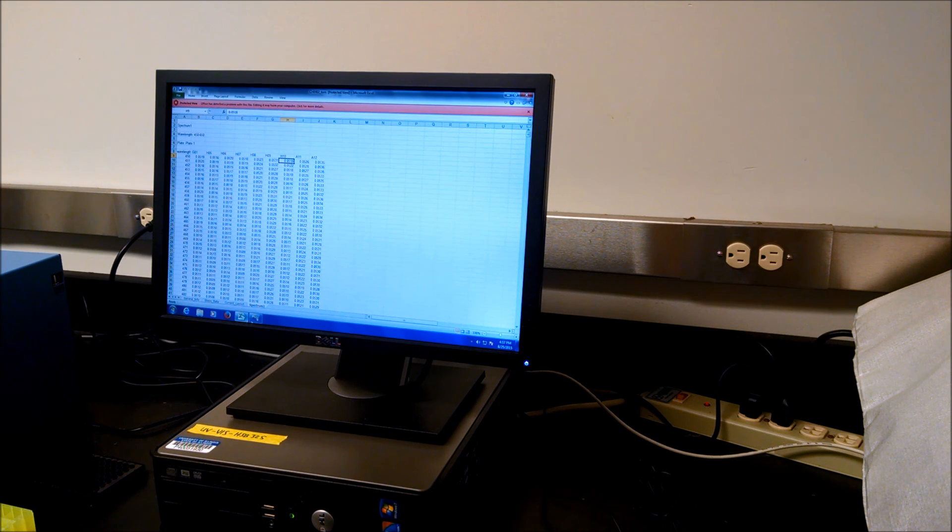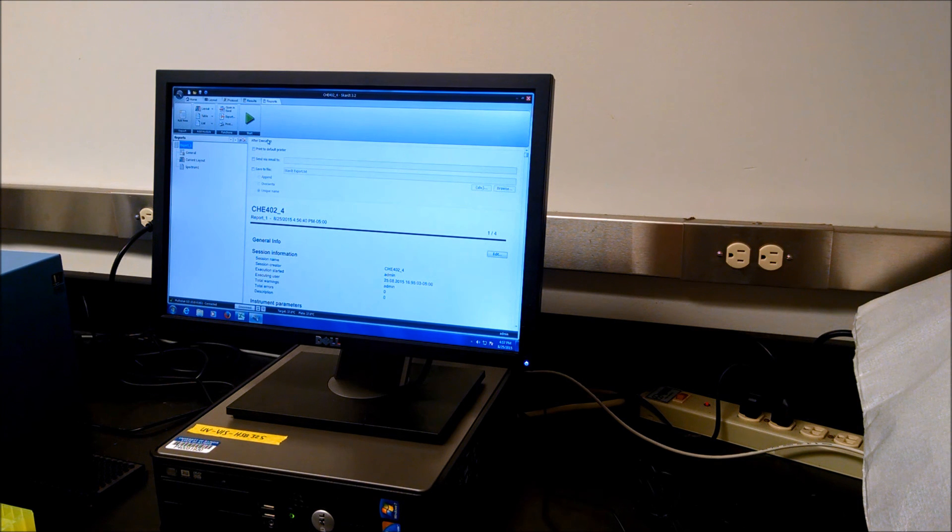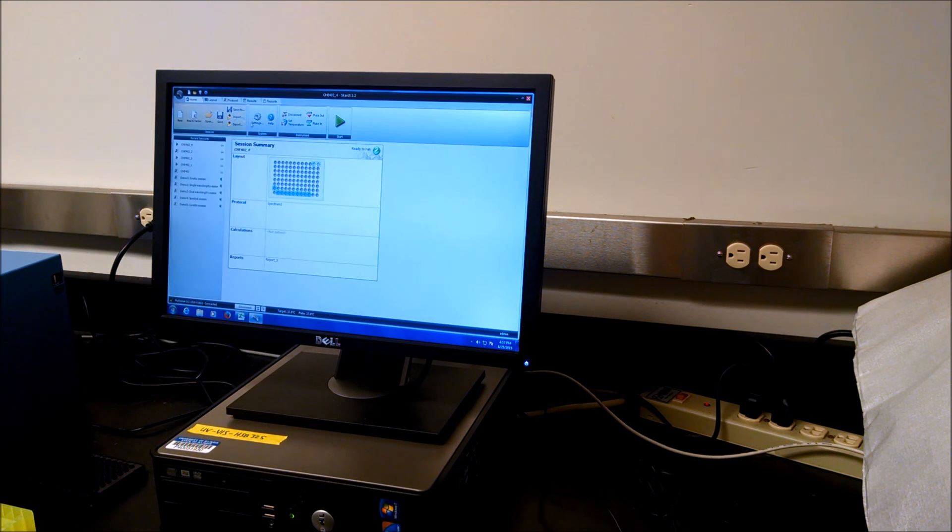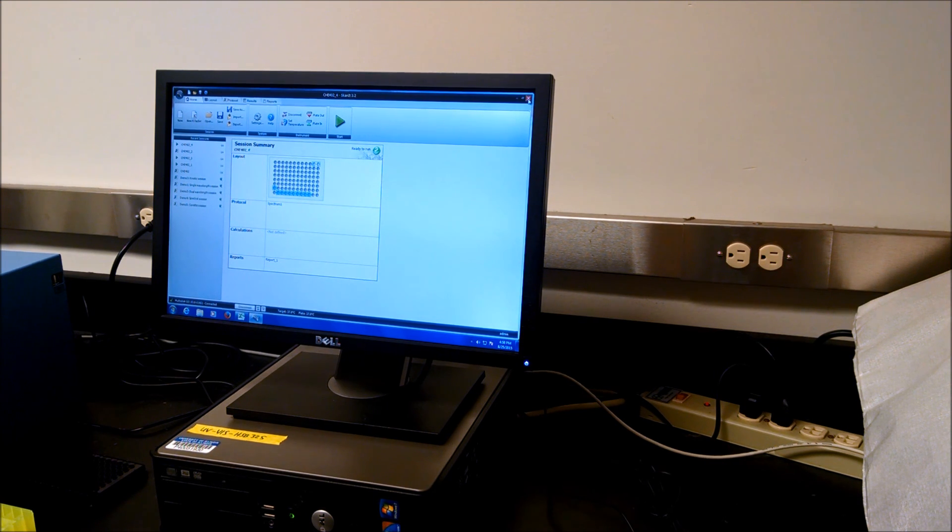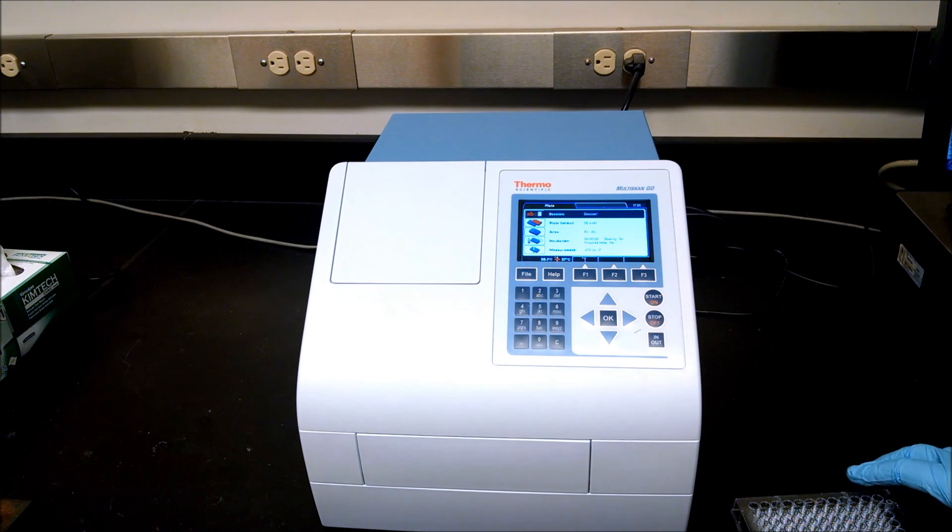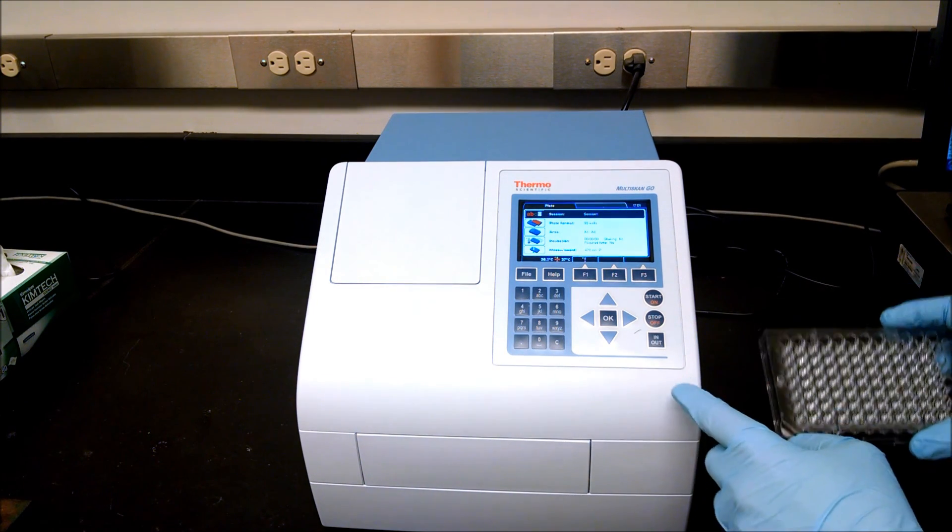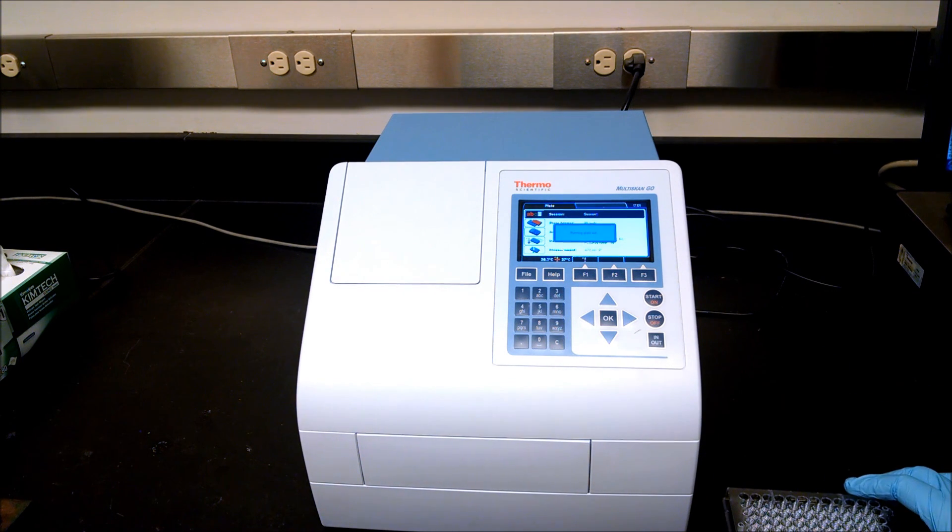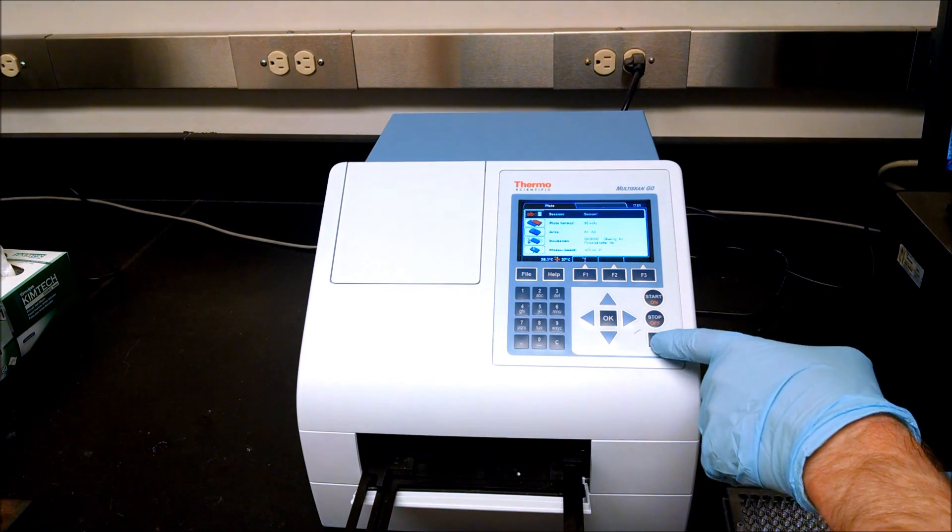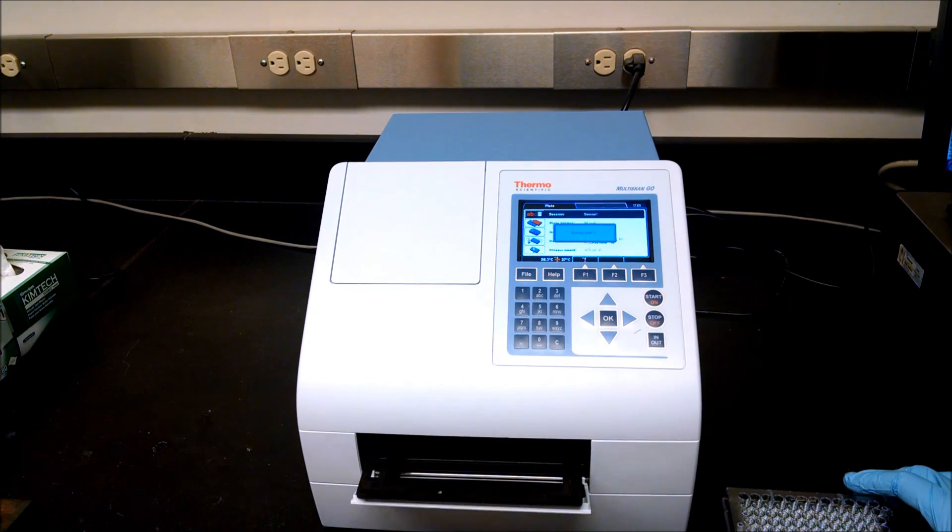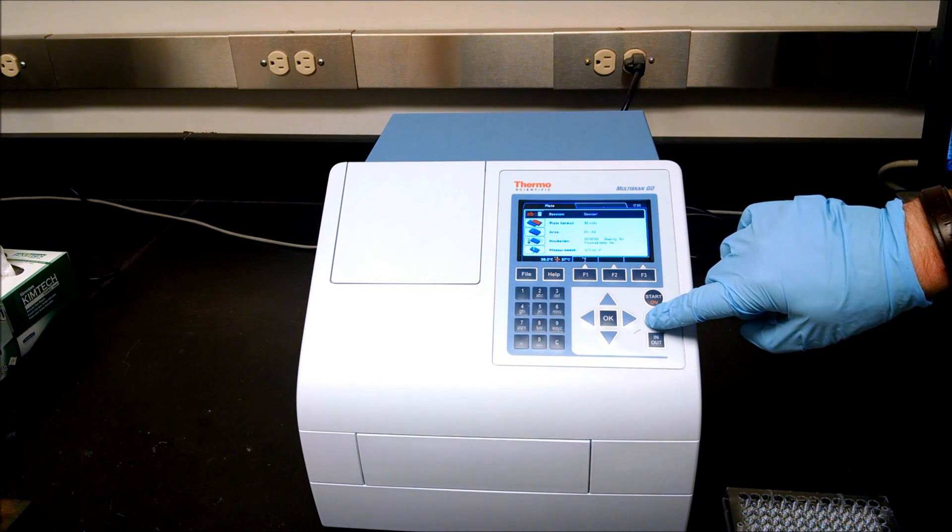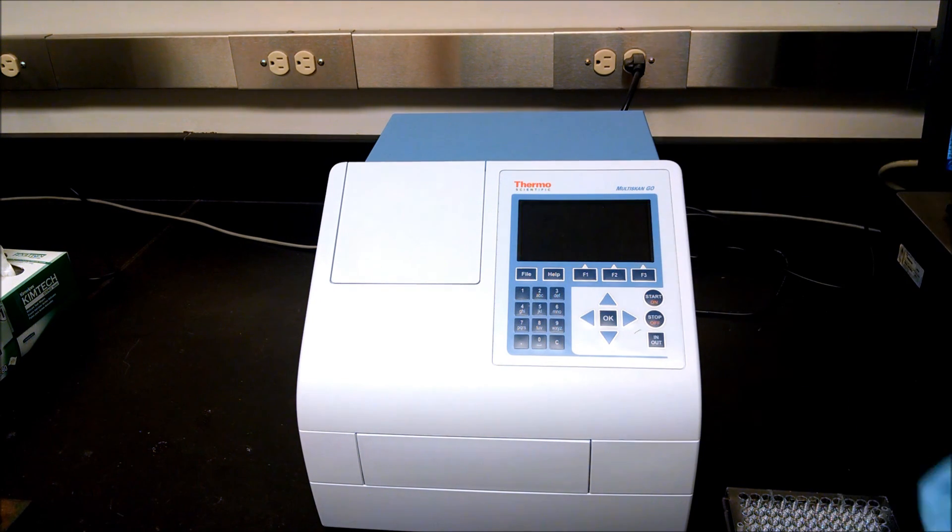To turn off the instrument, we want to make sure that we remove our plate from the instrument. Then we can go ahead and close up the instrument, close the software. To shut down the instrument, make sure that you have removed the plate from the plate reader. You see that it's empty, so we can push the in-out button, put the tray back in, and then press the stop off key and hold until you get the message that is shutting down.